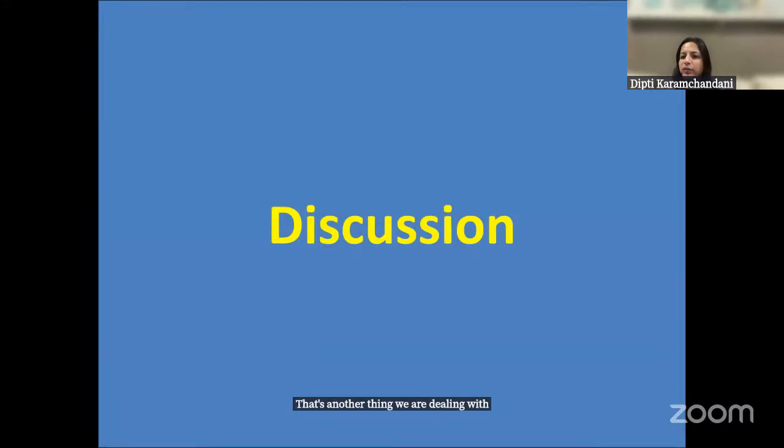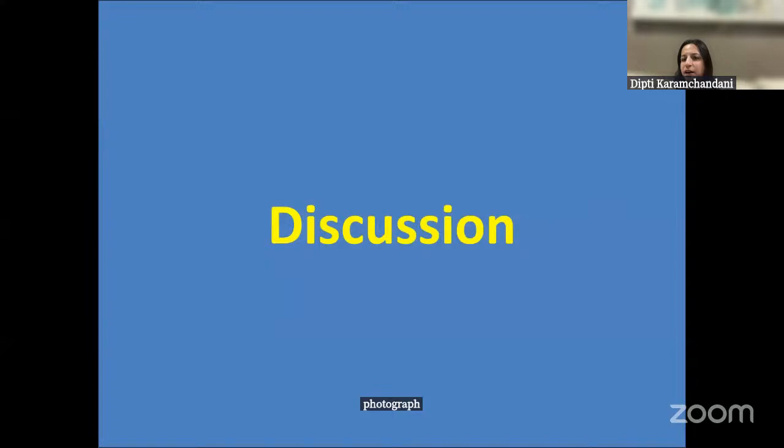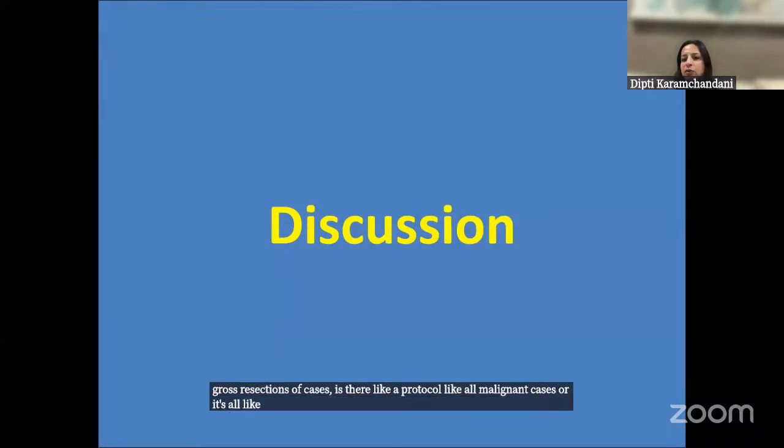I actually had a question for the panelists. How many of you take photographs on gross resections of cases? Is there a protocol for all malignant cases? In our institution, I'll tell you, we take gross photographs of all colorectal resections, but everything else pretty much is PA resident dependent. It's totally at their discretion. Sometimes they'll take pictures of some cases which we don't even need.